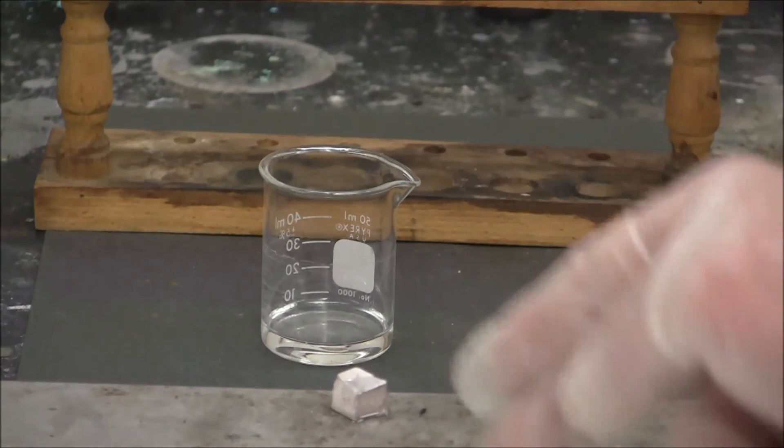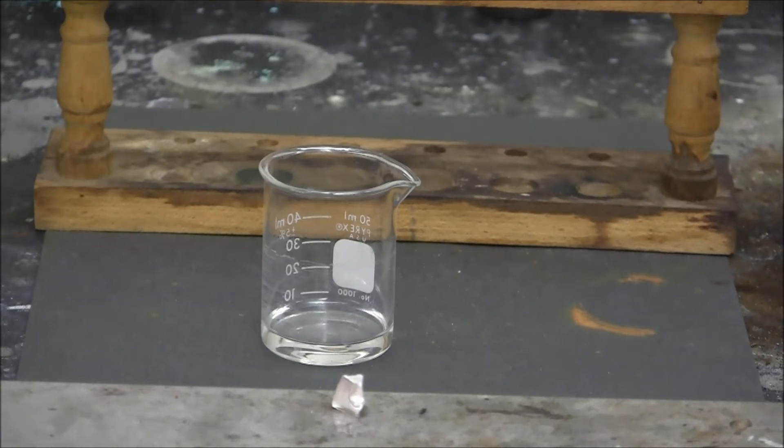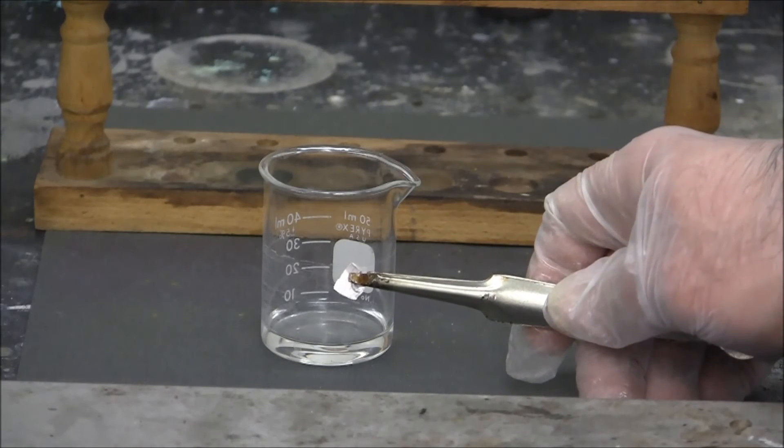On the countertop here I have sodium metal. I am going to cut a small piece of sodium metal and place it into the nitric acid.